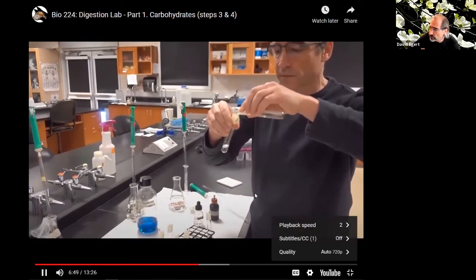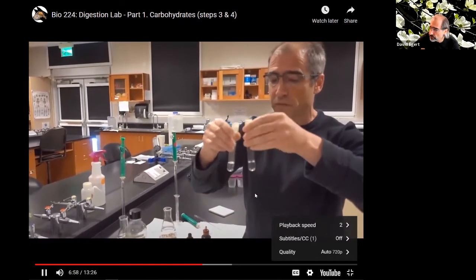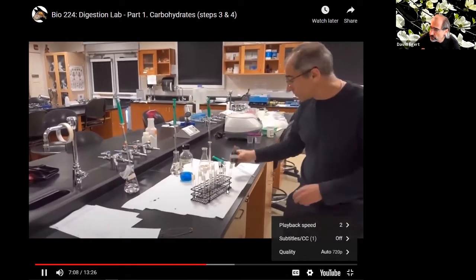So when we do our test, this should show up positive for starch, and not showing maltose. This one here is pure maltose, so we do the test for maltose. This should be positive for maltose, but have no starch present. That's how we're going to know our test is trustworthy. So we can start with the test for starch.